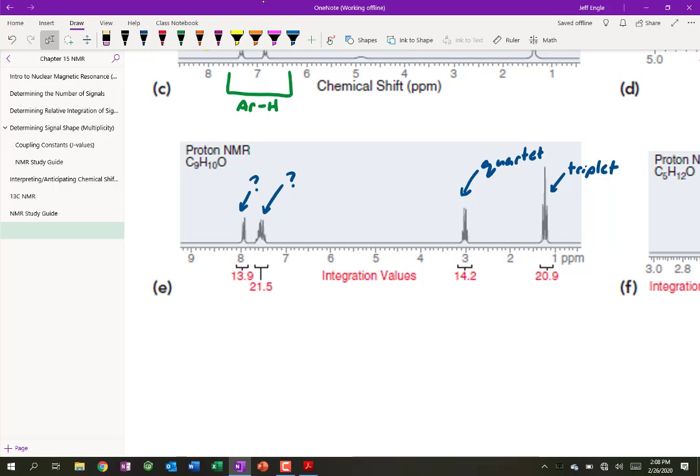So it's more trying to find whole number ratios. So let's say you divide by your lowest value, it's 1.5. And maybe we double everything by 2 to get it back to a whole number.